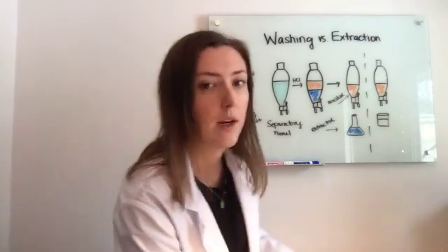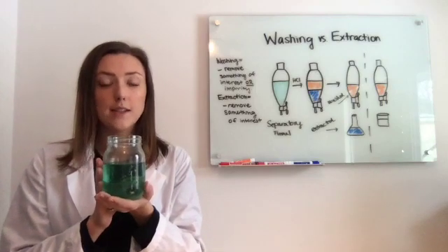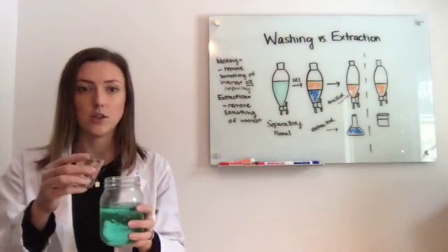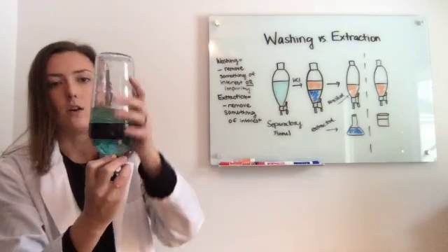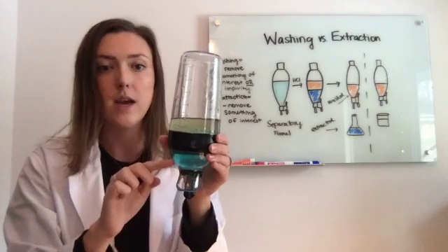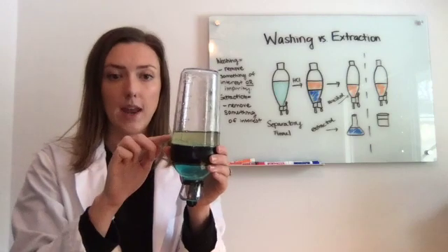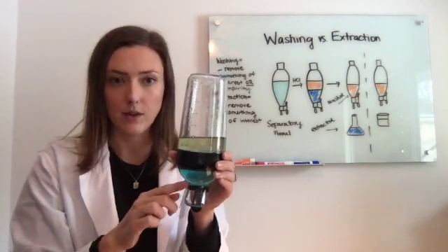For an example, we're going to pretend that we have a homogeneous mixture of organic base and an organic neutral, and for reasons you'll understand in a little while, if you treat it with a strong acid like HCl, pretending this is still a separatory funnel. After some inversion, you're going to be left with two separate layers based off of density. The aqueous layer, because water is quite dense, is going to be sitting on the bottom, the organic layer sitting on the top. We now have our organic neutral on the top and an organic base on the bottom.